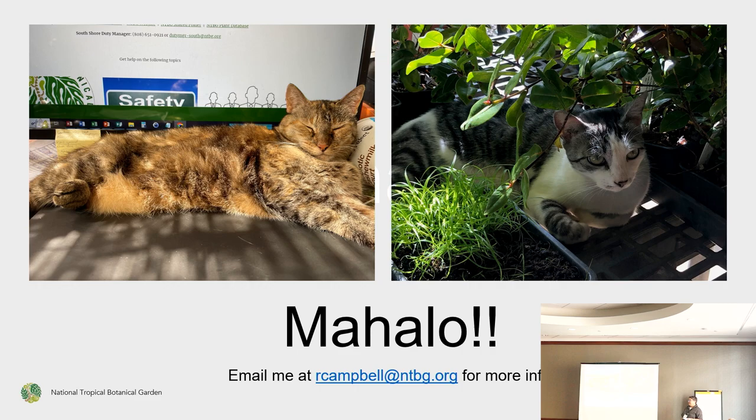A lot of it is the patience I mentioned a few times. When we first started, we were trying to grab them with tweezers and things like that, actually finding that trying to balance them on the tweezer, gently move the grains of dirt around, the media. It's just really taking more time and care with those plants. One other improvement we did was the plants would sometimes desiccate while they waited those 2 weeks for transplant. So we had the volunteers in the seed bank start adding a little bit extra water. It's a fine balance, though, because the dishes can mold. So you balance those needs out.